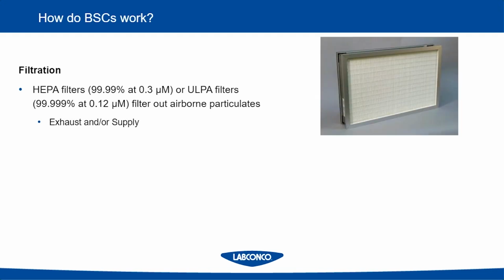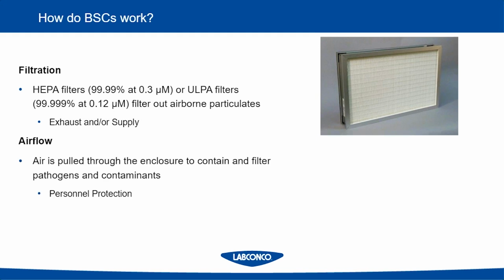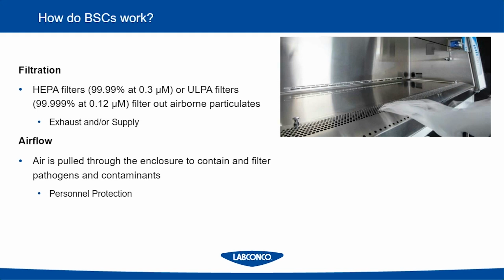These filters are either on the exhaust side, and some cabinets, as we'll discuss, also have a supply HEPA filter as well. In conjunction with the HEPA filters, airflow is used to make sure that the biohazards stay within the cabinet, are drawn away from the user to provide personnel protection, and also that airflow is used through that HEPA filter to provide product protection.